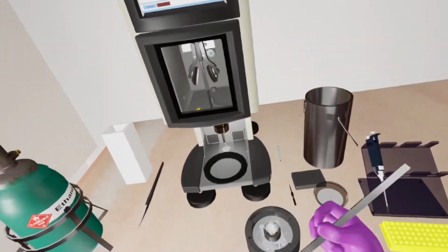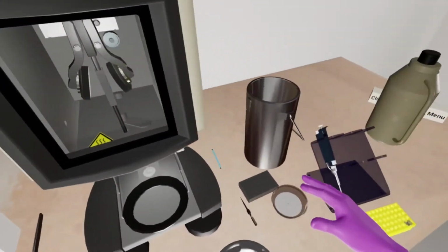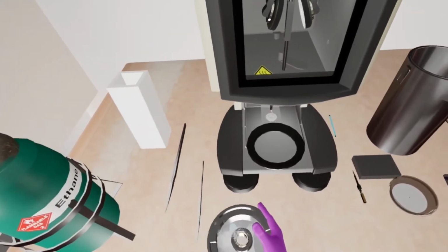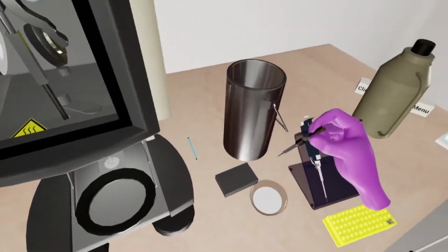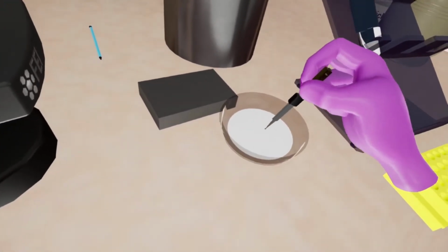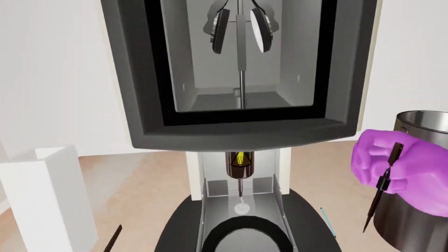Now, locate the Petri dish on the desk and remove the cover. You can see the grid in the Petri dish. Grab the tweezers. Pick up the grid with the tweezers. Attach the tweezers to the plunger.